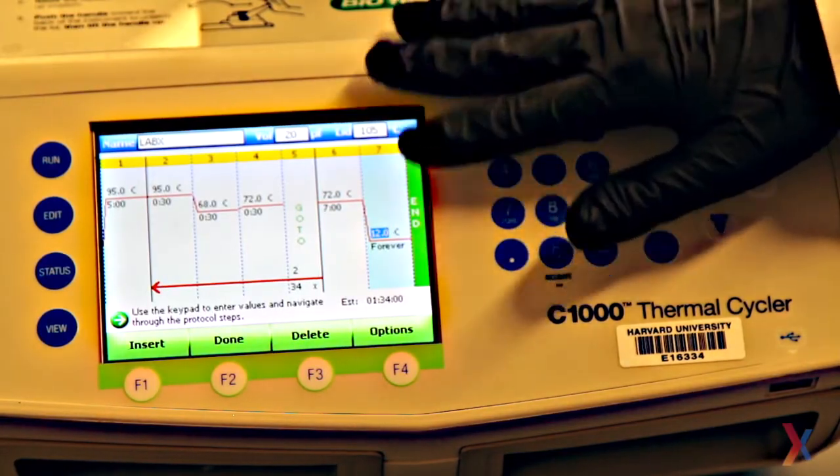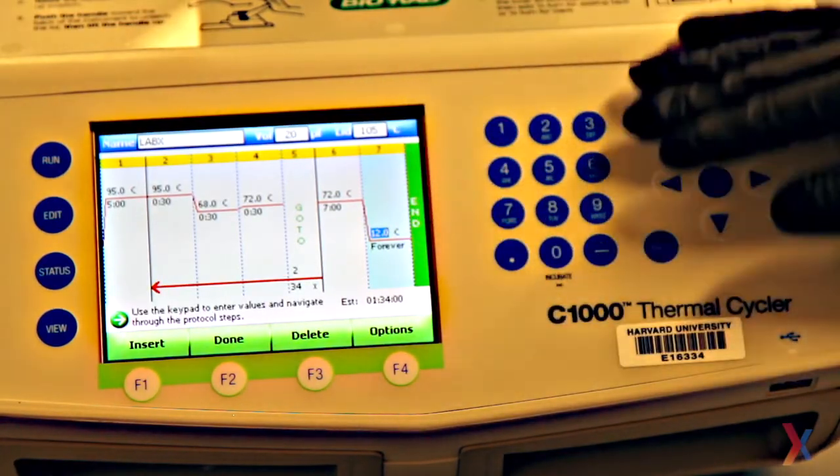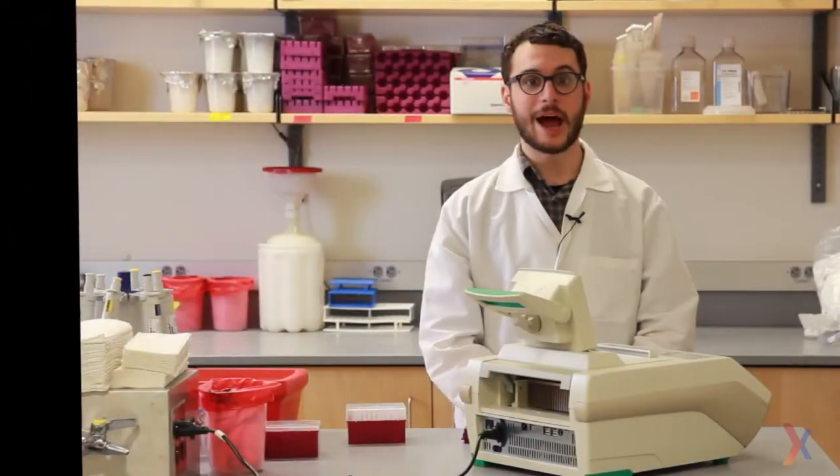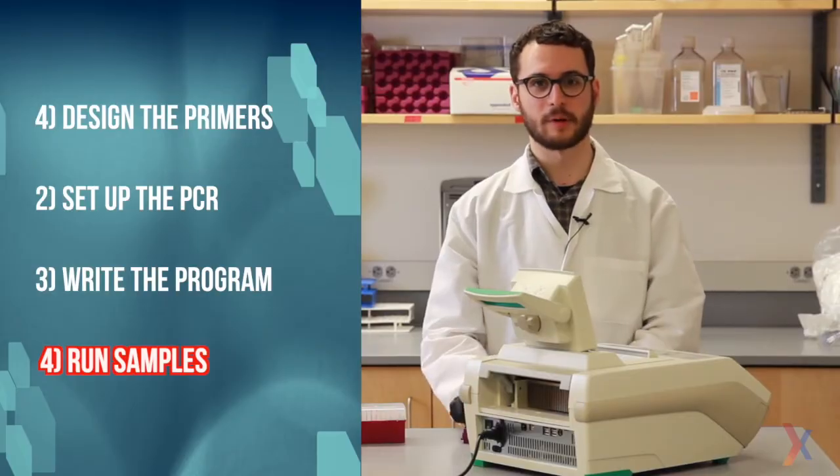And then finally, I want the thermocycler to stay at 12 degrees forever until I can come to the machine and get my samples so they stay nice and cool. Now I'm ready to add my samples to the thermocycler.